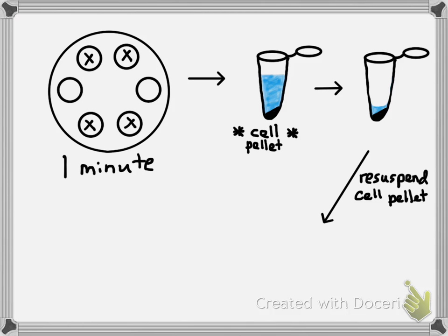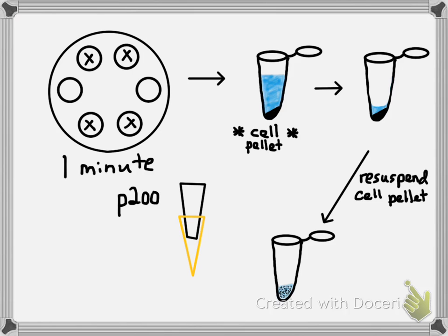So the next step is to resuspend the cell pellet in the small volume of supernatant that you left behind. You can do this by dragging your tube across the microtube rack a few times. The pellet should be gone and the solution should look cloudy. Come to me and obtain your next tube and write your pin on it, lid and sides. You will be adding your cell solution to this new tube.